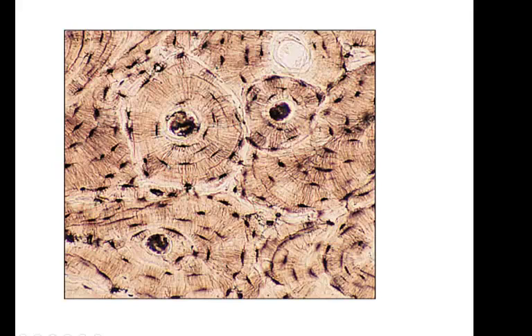And these little regions here, these little black things, these are the osteocytes found in lacunae, little caves where the osteocytes will be. So the bone cells are these black things that you see here. And these rings all the way around here are made of collagen fibers. We have tons of collagen fibers in your body. So this is what bone tissue looks like. We would identify this as bone tissue, and we would classify it as connective tissue. And don't say bone is, it's osseous tissue. So you could say osseous tissue is in your bone or in your skeleton.